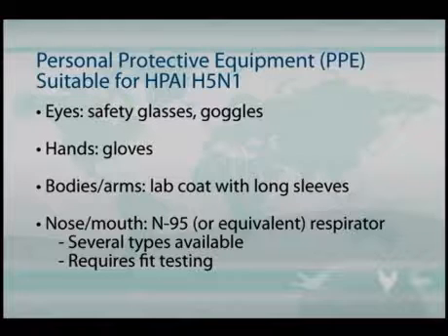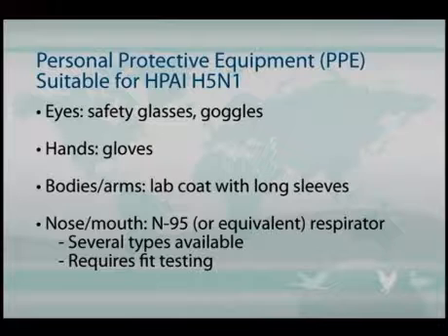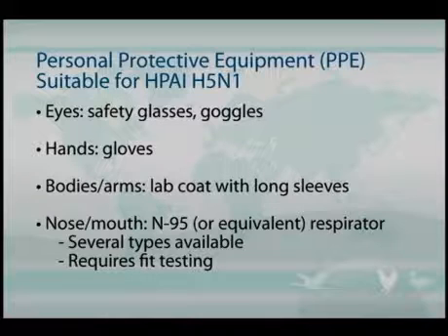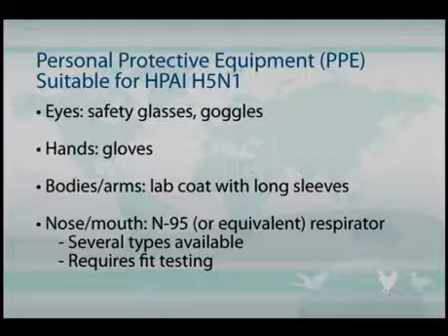But these are guidelines that we have developed in our laboratory for use with the highly pathogenic H5N1. We are requiring all people to wear safety glasses, and this is a standard procedure, whether we're working with just routine diagnostic samples or with the high path H5N1. Gloves are required.